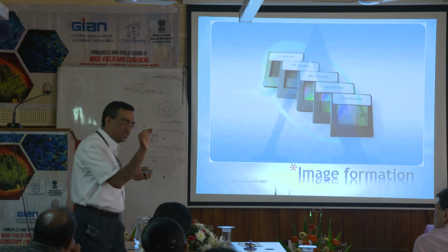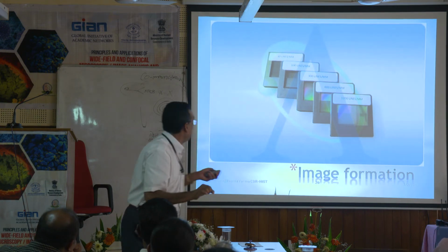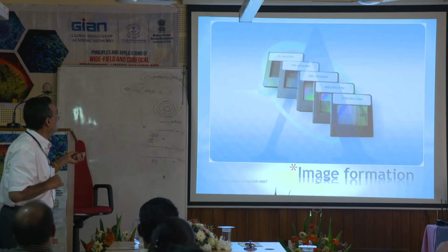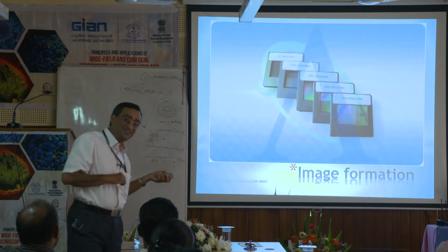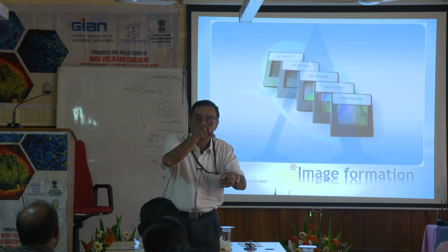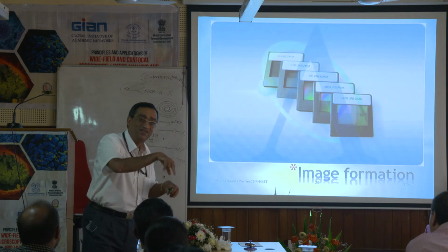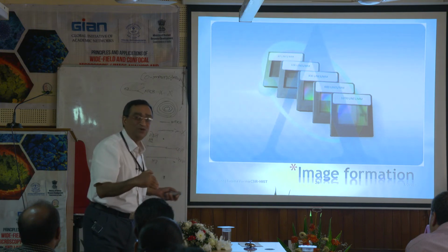These are all transparent objects with a series of parallel lines drawn. The first one has 50 lines per millimeter. The second one is 100 lines per millimeter. The third has 300, then 600, then 1200 lines per millimeter. We can also have a diffraction grating with two different pitches, or line spacings, together. For example, 50 and 100 together on one grating, upper side having 50, lower side having 100. That is also possible.